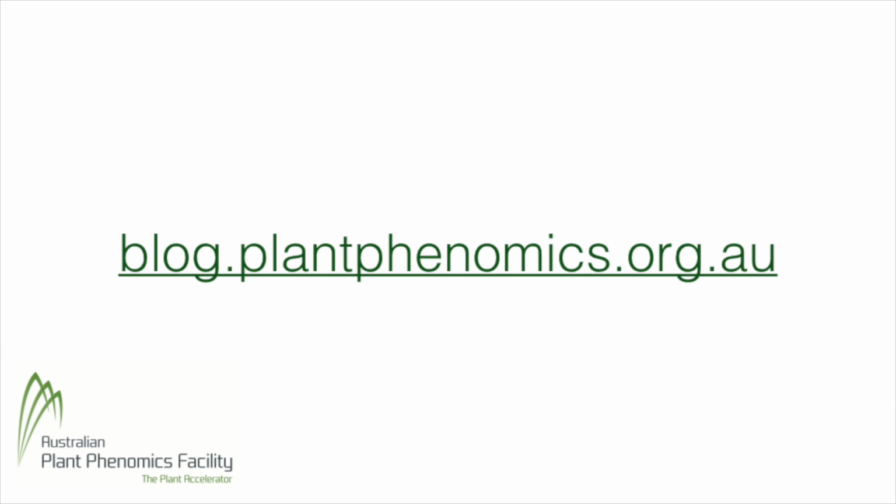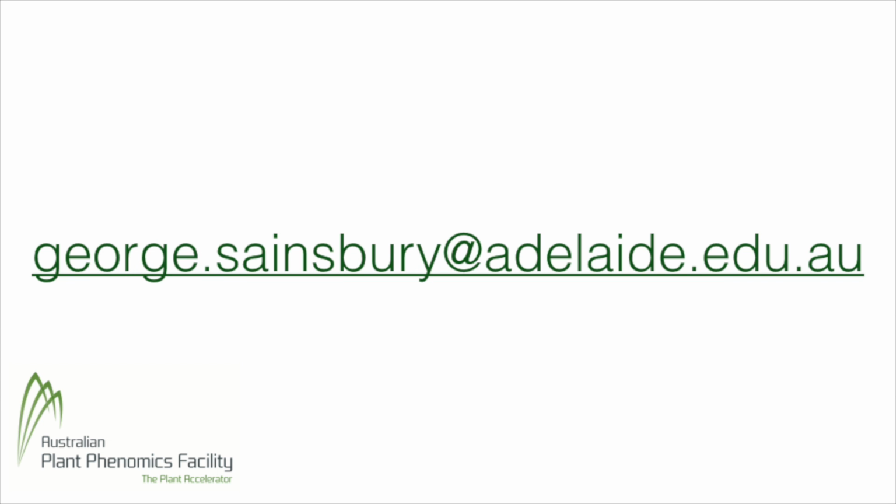If you're a customer of the Plant Accelerator, you can gain access to your experiment prior to a public release by contacting us. You'll then be able to log into Zegami and see your collections alongside the public ones. Authentication is managed through the Australian Access Federation, so you will log in using the credentials from your home institution or visitor accounts available through the University of Adelaide.